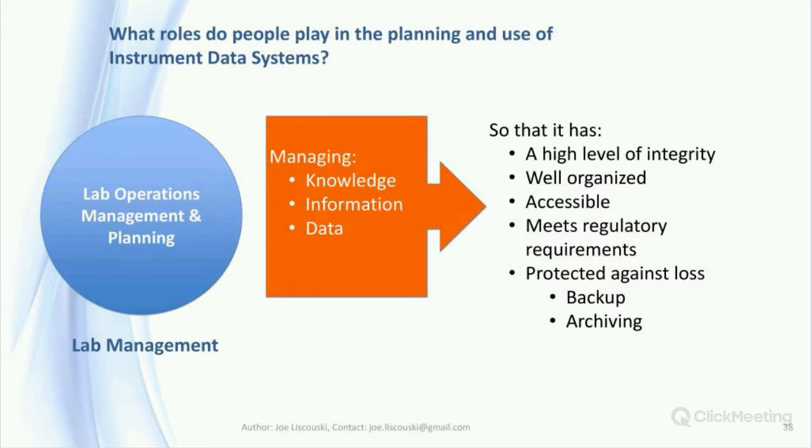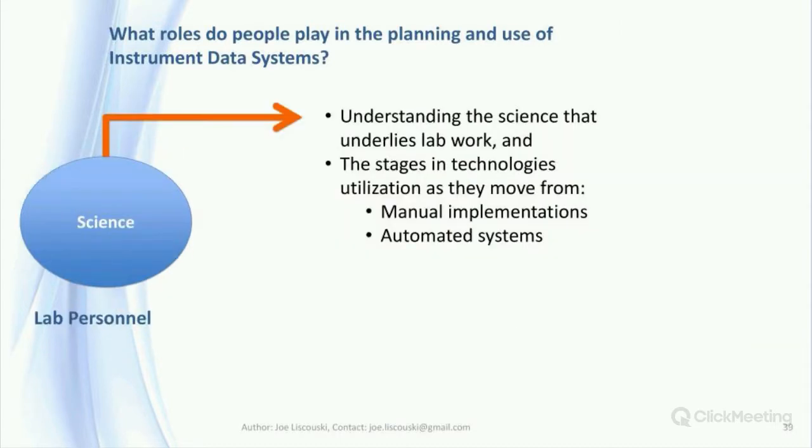Lab managers are responsible for defining the behavior of lab systems and the goals that should be covered by laboratory implementations. With regard to instrument data systems, that includes the number of instruments tied to computers, where choices exist, and how the lab data and information are spread across data systems, SDMSs and centralized systems, for example. In order to do that, they need a solid understanding of the capabilities of those technologies and how they apply to lab work.